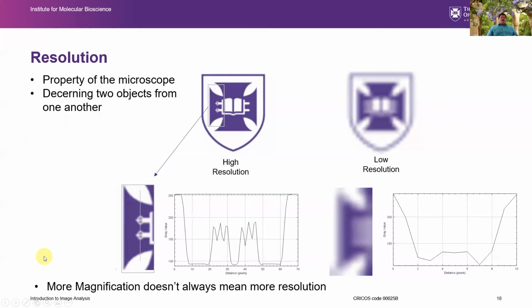Now, simply having more magnification doesn't always mean that you're going to have more resolution.